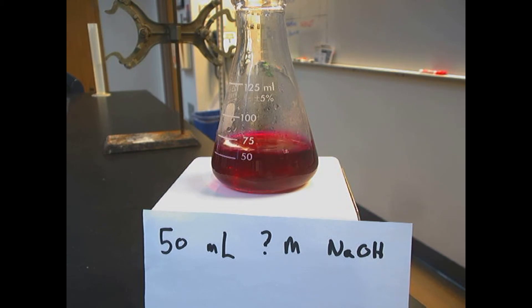And that means we've brought it to what we call neutralization. If we know the concentration of acid, and we know the volume of the acid that we added, and we know the volume of our base, we can find the concentration.